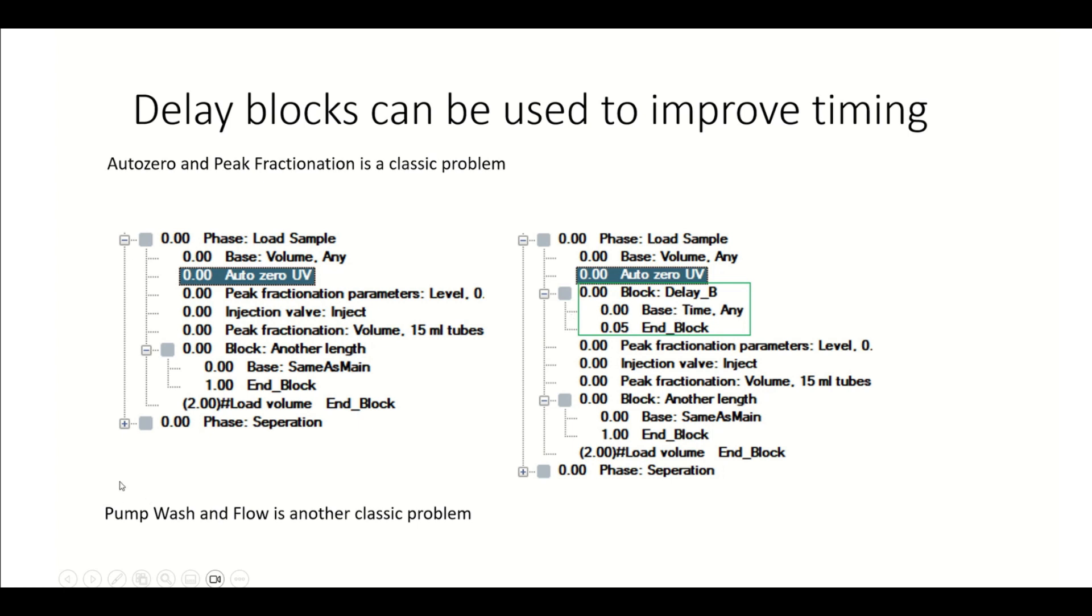Another thing I think happens more with the pilot is that if you have a pump wash instruction followed by a flow instruction, sometimes you'll get a warning signal that says the flow is just ignored because you tried to do a flow instruction while the system was washing. Because there's different flow ring on the system in order to be able to do the pump wash. If I could sum up these last two slides, it would just be that not everything happens at once and there's consequences for that happening at once. And delay blocks are a great way to improve timing.